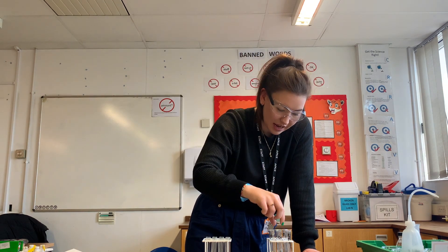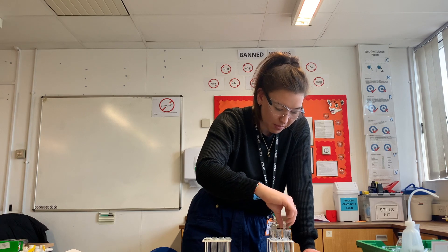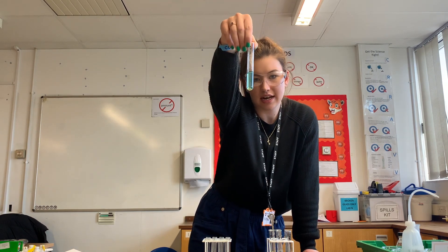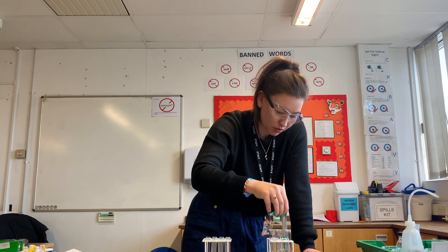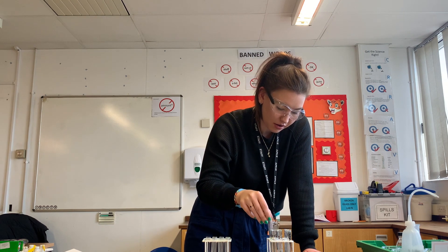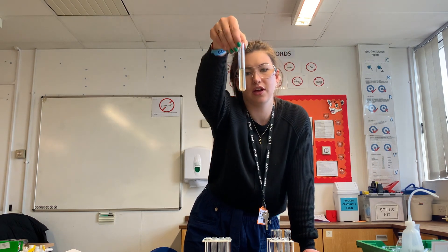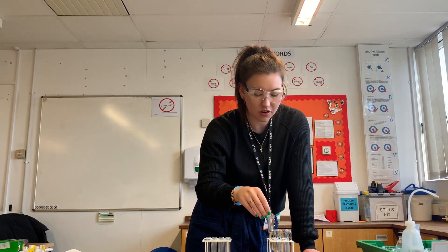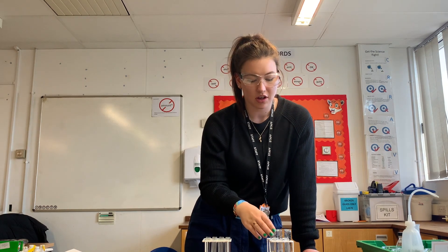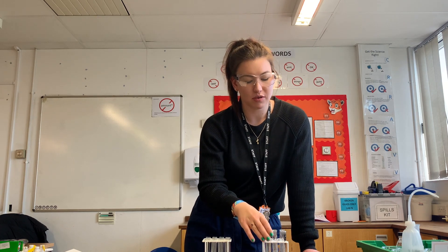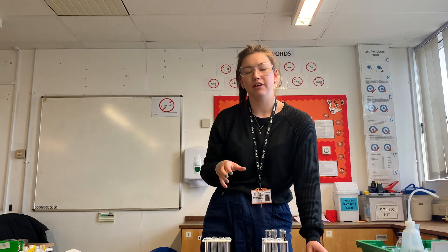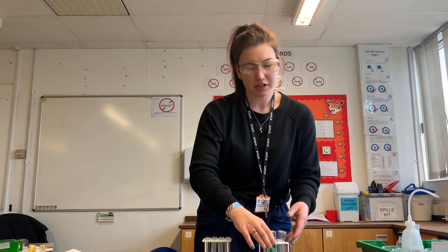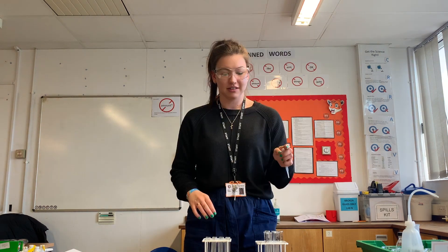As you go up in glucose concentration, the solution becomes slightly less blue, all the way up to our one percent glucose which is not blue at all anymore. The reason this hasn't gone brick red is that the quantitative Benedict's solution we use is slightly different to the qualitative Benedict's solution, but the same principle and the same process is happening.